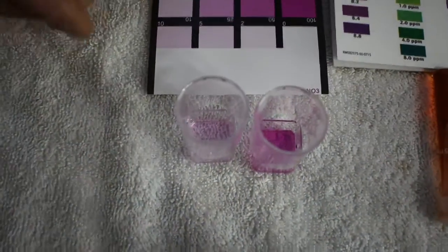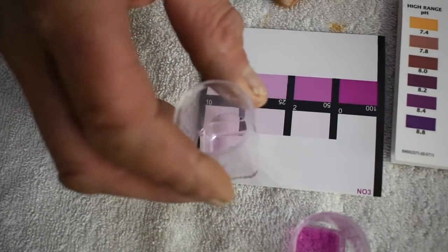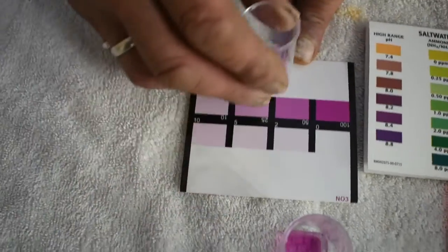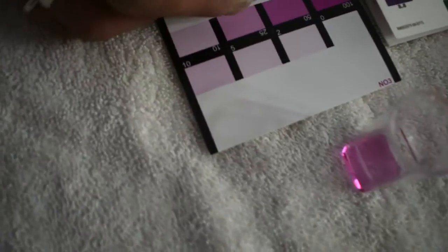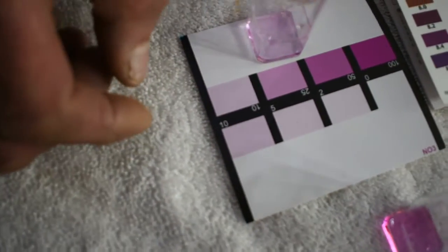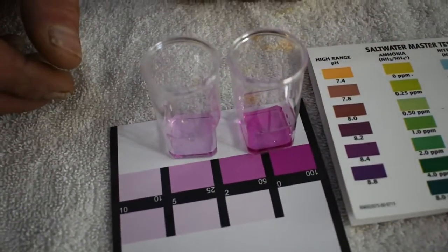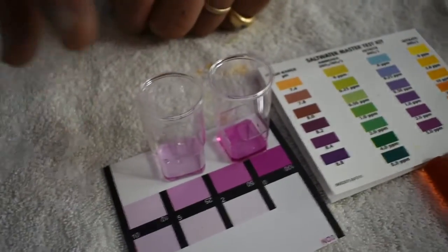Now over here to the Salifert — this is obviously our water sample. We've got about forty parts per million on the API, and I'm seeing a little bit less on this one, maybe closer to twenty-five. And then this is the one where we got closer to a hundred parts per million. So both these test kits are telling me this one's moderate and this one's severe.